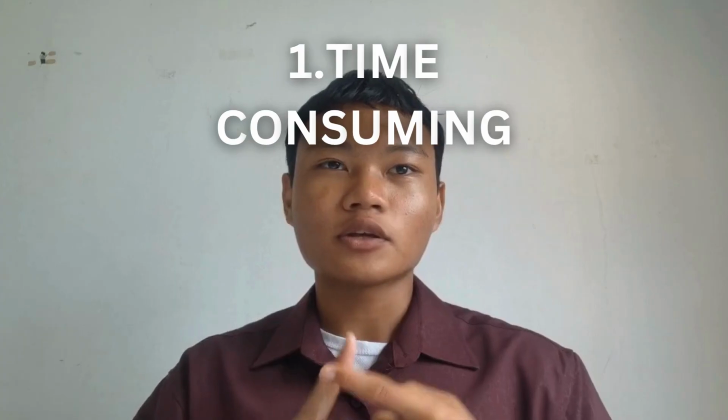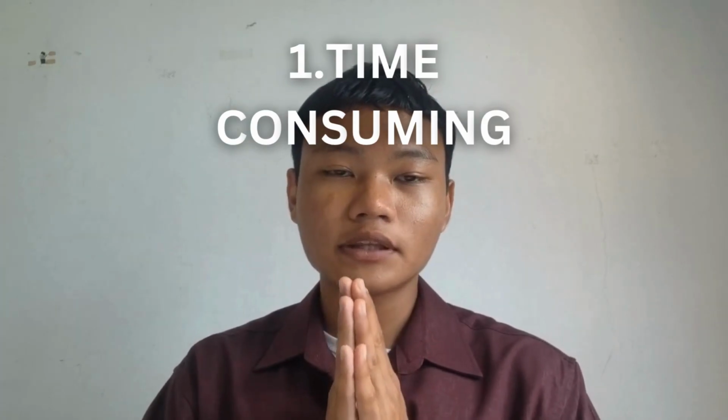Alright, let's dive into the disadvantages of gravimetric analysis. Number 1, it's incredibly time consuming. You have to wait for the precipitate to form, to filter it, wash it, dry it, and cool it, all of which can take hours or maybe even days. So you might as well go cook dinner, watch a TV series, or maybe take a nap. Okay, alright, number 2.